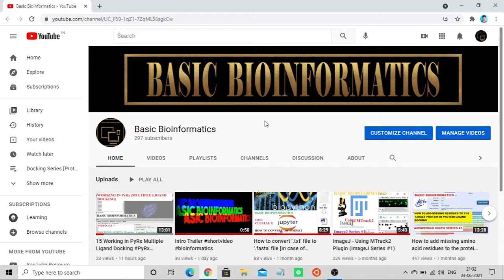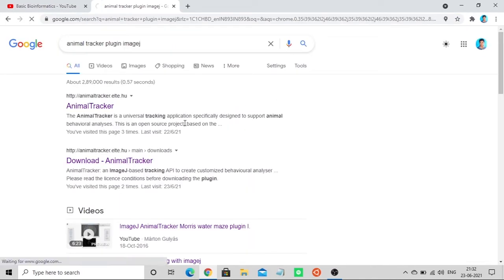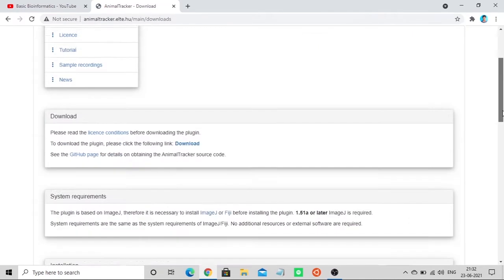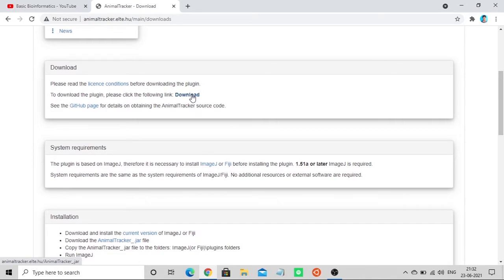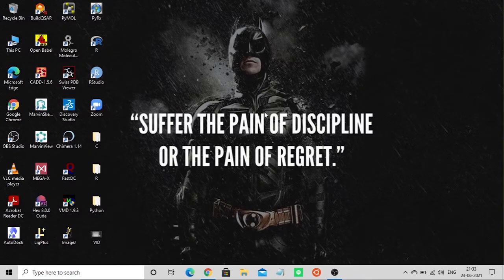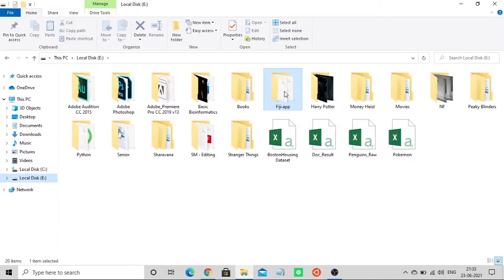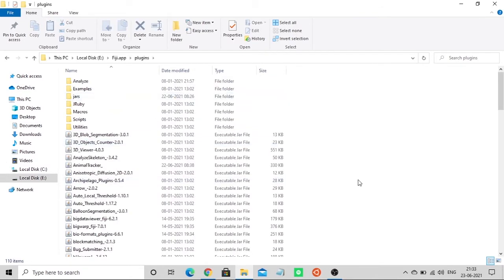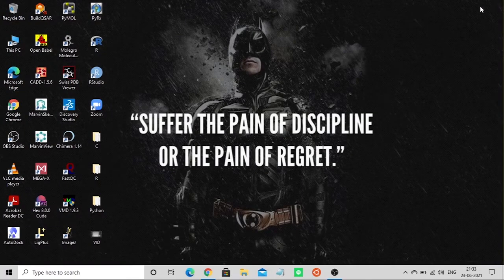In that video we explained how to install ImageJ and how to install plugins. To install Animal Tracker, go to the tab and type 'Animal Tracker plugin ImageJ' — you can find the website link there. Download the file, which will be in .jar format, and place it in the Fiji plugins folder.